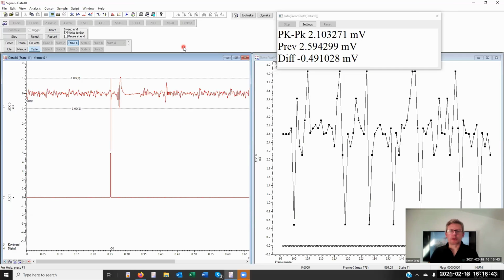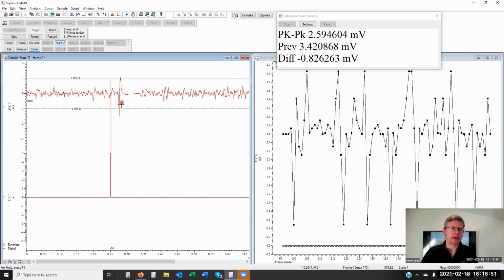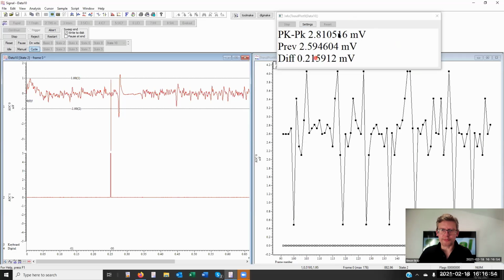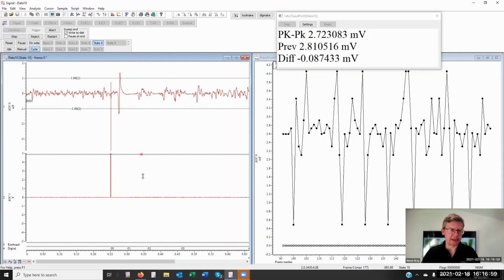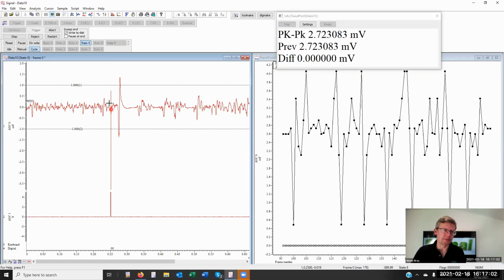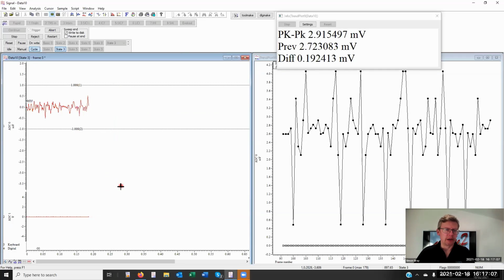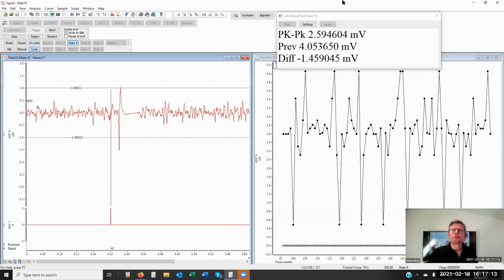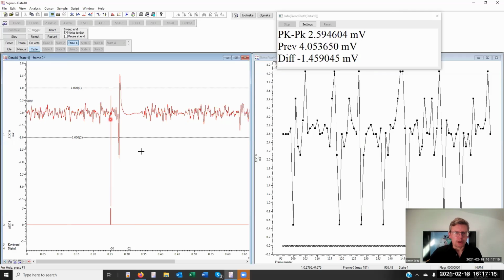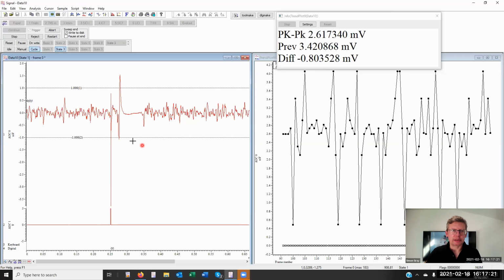So we've got some fixed horizontal cursors just to give us a guide as to the size of the response here. We've got our textual output as well. To make it easier to see what's happening on the screen, I'm expanding the upper channels area using shift and drag. Right, now I think we need to move on to other types of analysis.